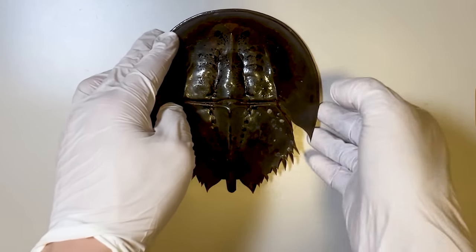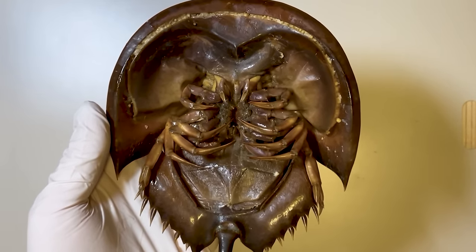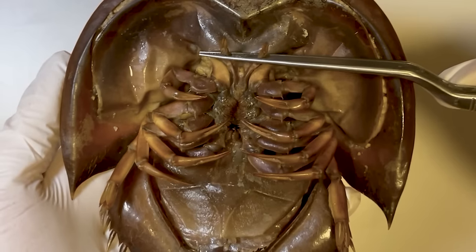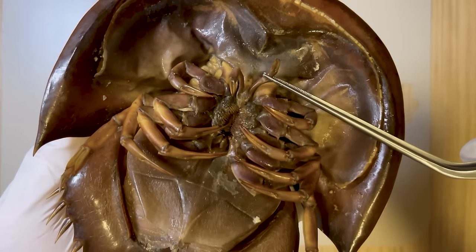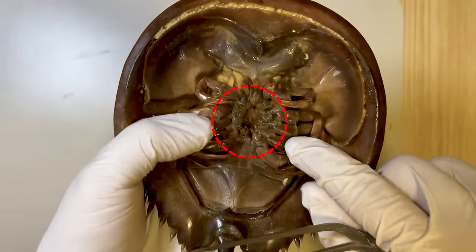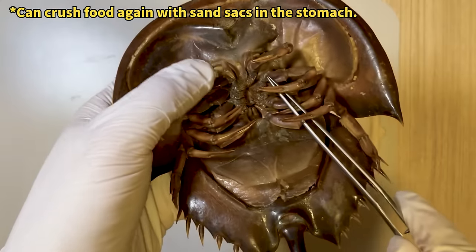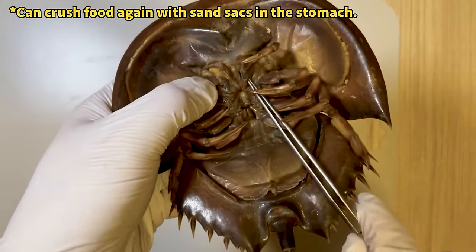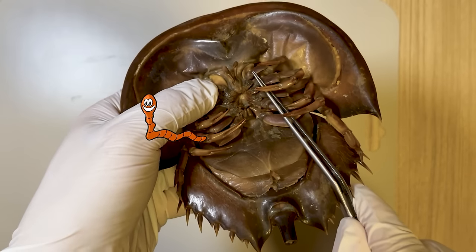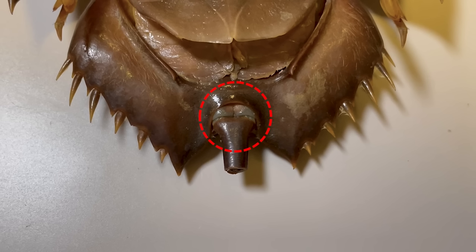Turning our attention to the underside, we observe that the horseshoe crab is equipped with six pairs of legs. The first pair, known as chelicerae, is employed for feeding. Despite using tong-like claws to bring food to their mouths, the horseshoe crab's mouth is unusually situated between these legs. Due to their small mouth, horseshoe crabs are limited to consuming smaller creatures — primarily small crustaceans, shellfish, and worms. The horseshoe crab's digestive tract extends from its mouth to its tail, with digested food expelled through its anus, positioned between its tail and stomach.